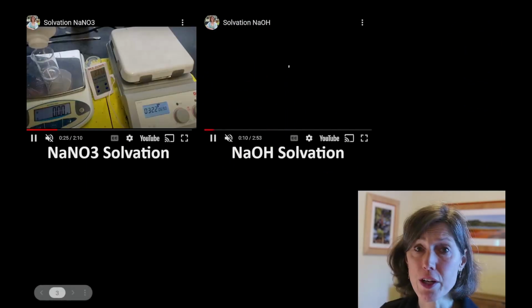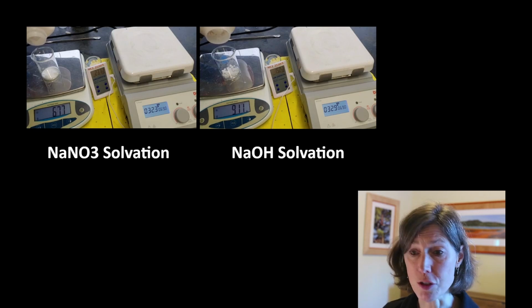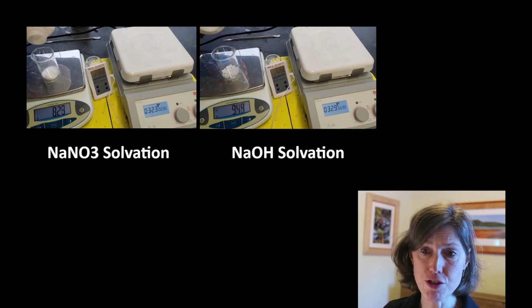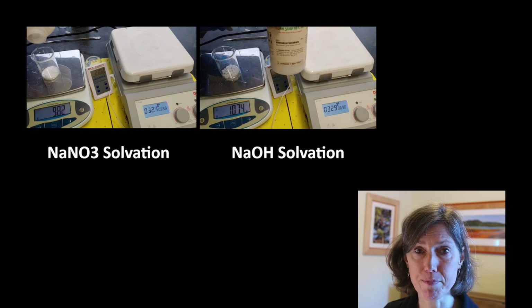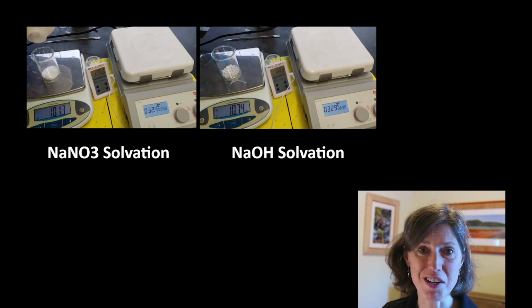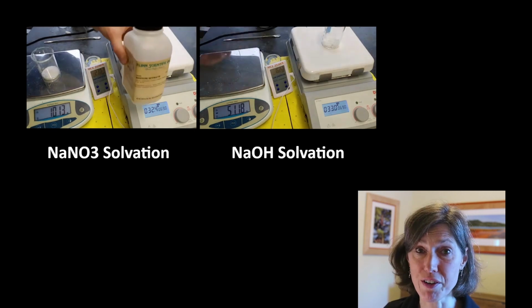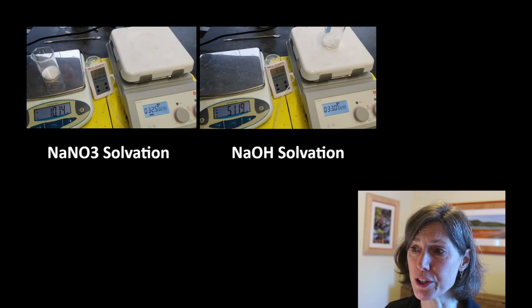I'm showing you here 2 different salt solutions, sodium nitrate and sodium hydroxide. The students measured 10 grams of each, obviously using a balance, and then the next step was to transfer their beaker to a hot plate. And the most fun they had was to simply add a stir bar to their various beakers. Again, we did 7 in total. I'm only showing you here 2.